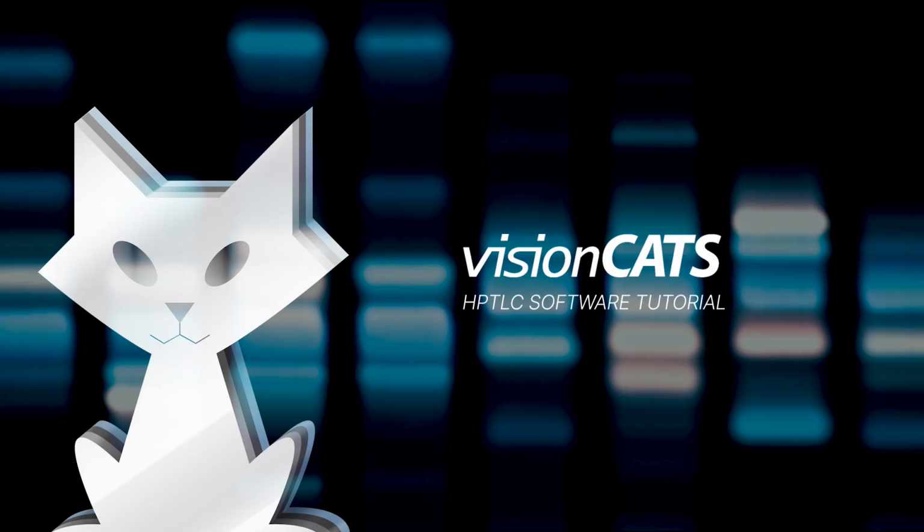Welcome to this tutorial on using the System Suitability Test, or SST function in visionCATS. In this guide, you will learn how to configure SST parameters using the Universal HPTLC Mix, UHM, and how to generate a method for routine analysis.